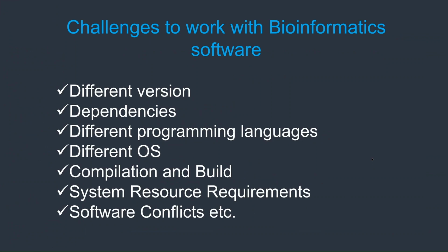Not only the dependencies, there are many other challenges that are associated with installing bioinformatics software, such as, often we use different versions of the same tool for different projects, and those tools often are developed using different programming languages. Often those tools are built on different operating systems. There could be issues with compilation and build, and system requirements could be very different depending on the tools. Often there could be conflicts between softwares within the same project. Also, often we'll find some tools that are not well documented.